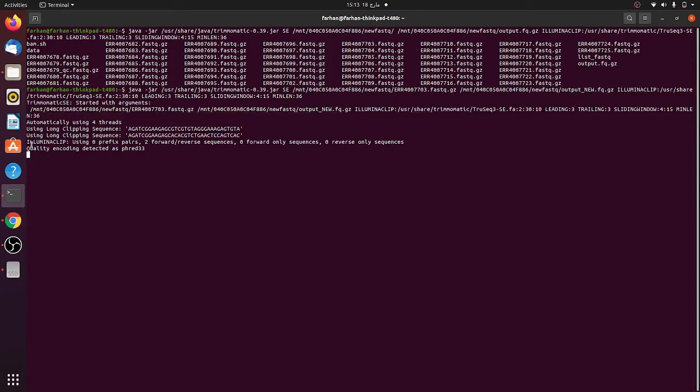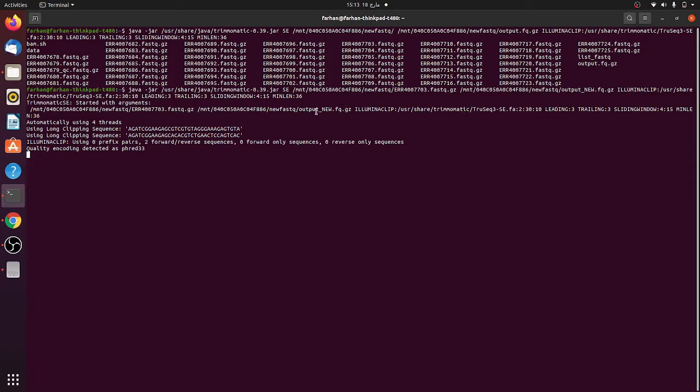After checking the file it will save it into this output new FASTQ file. These are all the information that is available, and the quality encoding detected as PHRED33. Now the command is running and it is actually generating a new output with the name output_new.